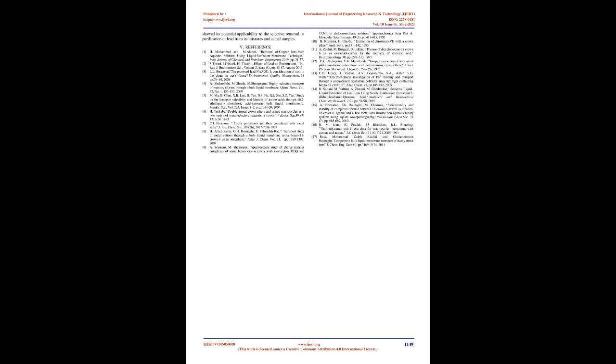Prior to the extraction procedure, soil samples from different locations were collected and contents of metal ions were measured, Table 5. The samples were subjected to the extraction procedure with dichloromethane under proposed experimental conditions, and after the organic layer was removed, aqueous solutions were analyzed with FAAS. The results showed that the proposed extraction procedure efficiently, 93%, removed Pb(2) ions from sediment samples and no interfering effects of coexisting ions were evident, Table 6.